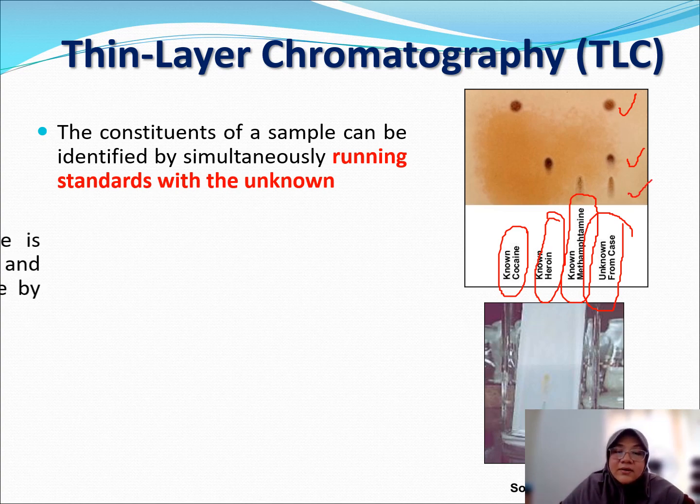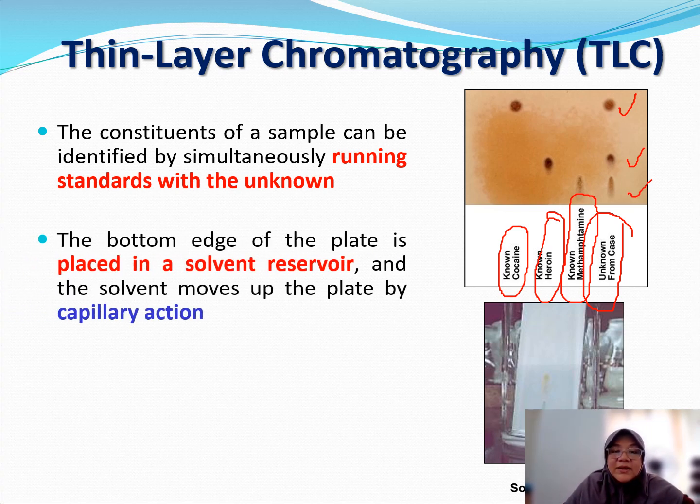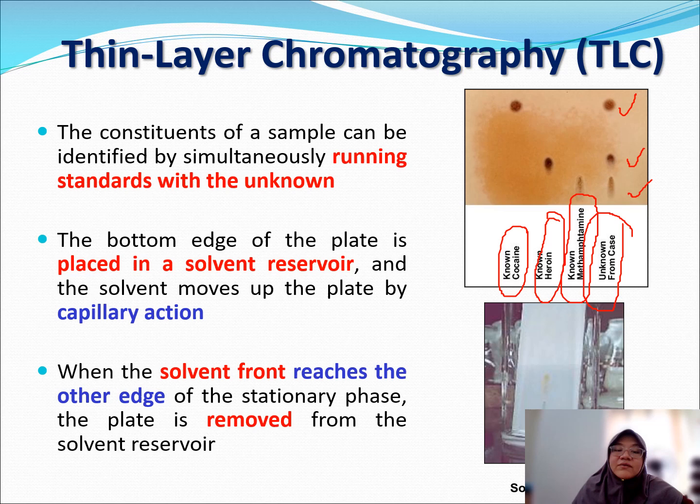Okay, and the bottom edge of the plate is placed in a solvent. The solvent will move up, maksudnya dia akan dip this TLC plate dalam mobile phase, as a solvent, and then the solvent will bring the samples along the TLC plate using capillary action. When the solvent front reaches the edge, you have to remove your TLC plate from the solvent reservoir.